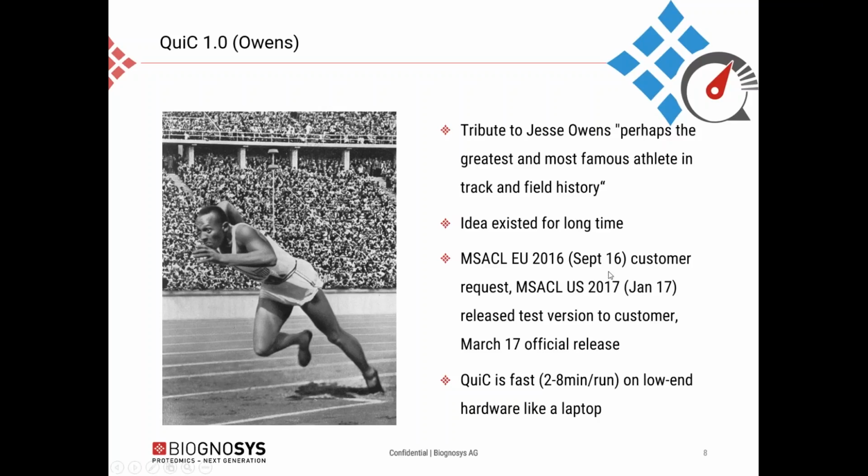Then in September 2016, we talked at a conference with different customers, and they all requested such an easy-to-use, intuitive QC tool. We then went back to our R&D department, and they started working on a QC tool. And at the MSACL US 2017 in January, we released a test version to our customers. Last week, we then officially released QuiC 1.0.